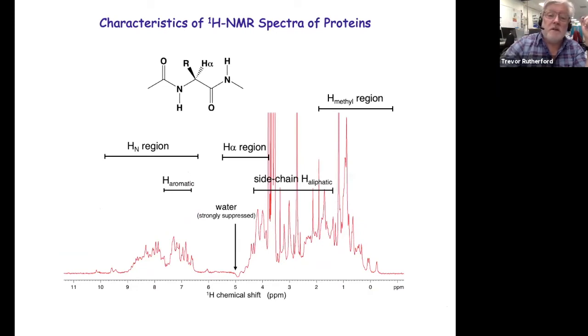We won't say much about this, just that the proton spectrum of a protein largely breaks down by the primary structure, the electronic structure around each group. Each of the HNs, for example, is resonating in a narrow region, and similarly methyl groups in the side chains will all be in a fairly narrow region. So the spectrum breaks down according to the composition of the molecule.